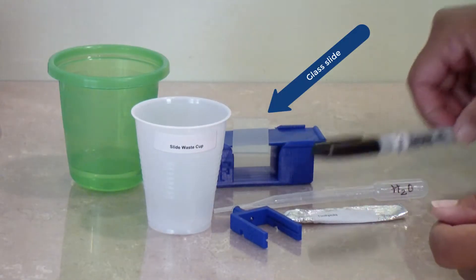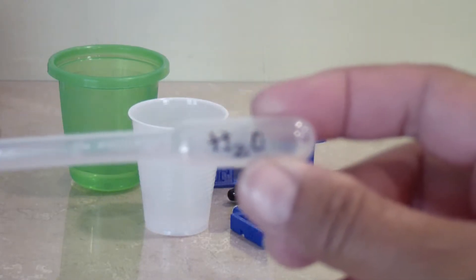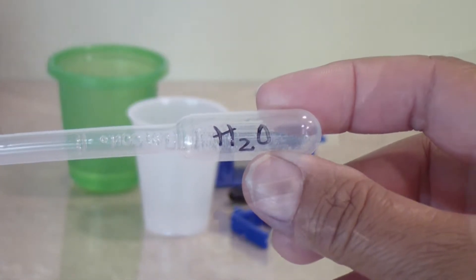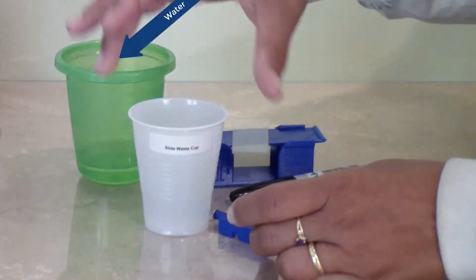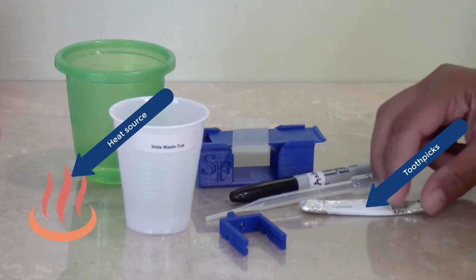You will need a glass slide, a permanent marker, a transfer pipette marked to use throughout the semester for water, water, a waste cup, a slide holder, a toothpick, and a heat source.